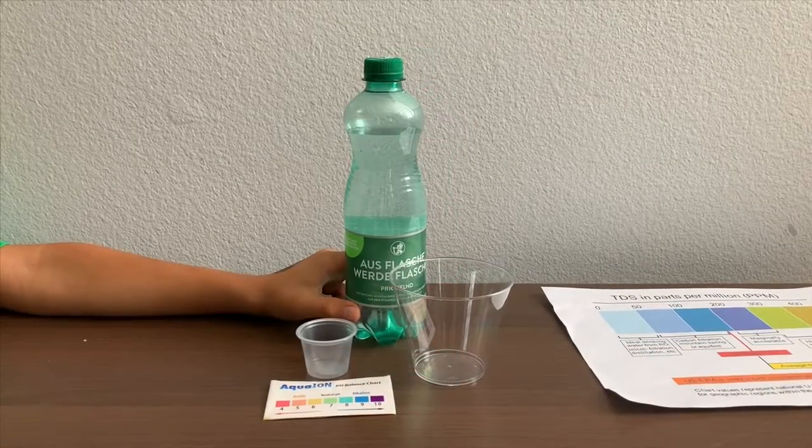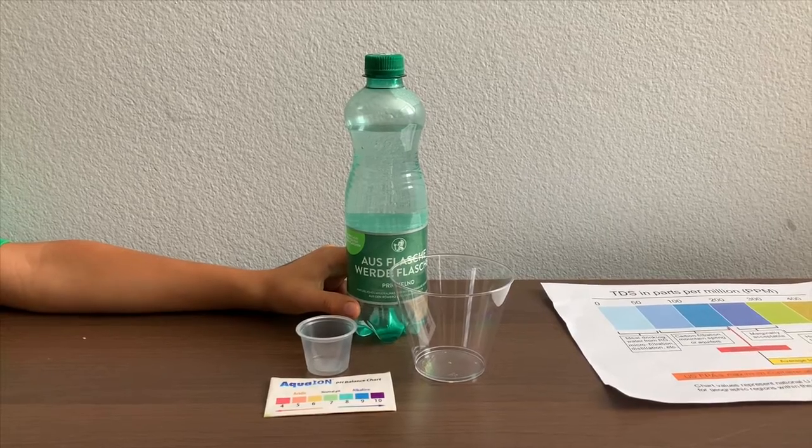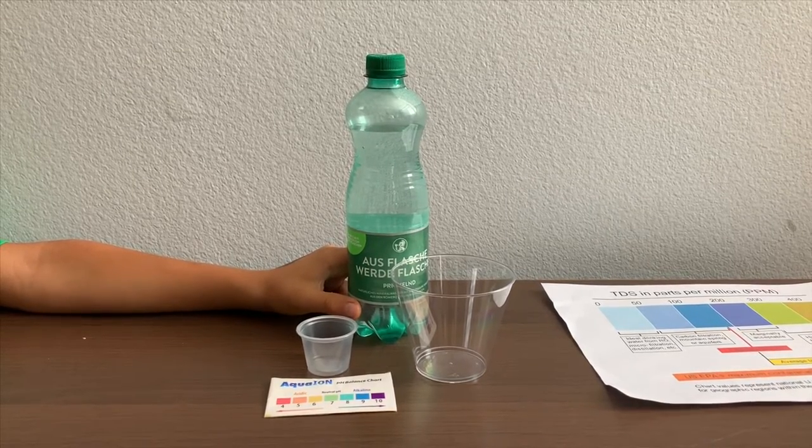This is Aus Flasche Werde Flasche Prickelnd Mineral Sparkling Water. We bought it from the Austrian airport. Let's test the pH and TDS levels.